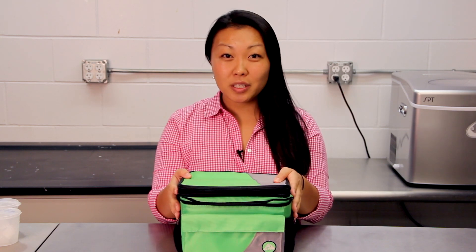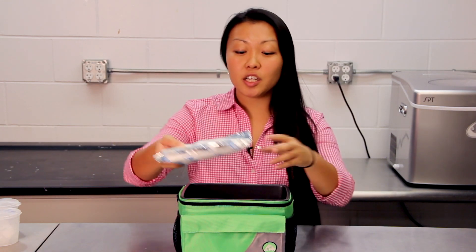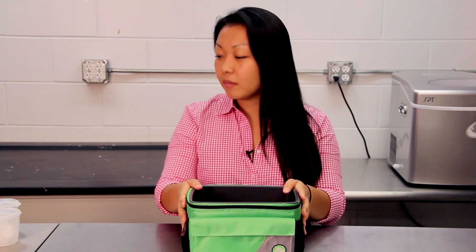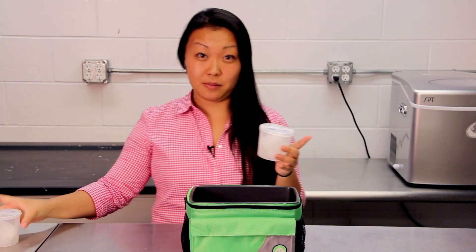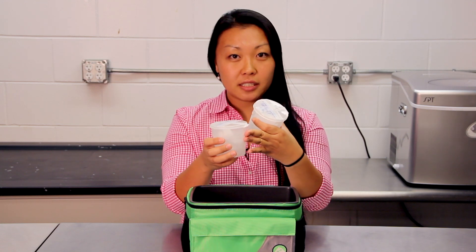Now it's time to ship your ice samples. Take the insulated cooler that we've already sent you along with your already-frozen ice packs. We're going to layer them — the first freezy pack goes at the bottom. Then take your ice specimen cups. You'll notice I have taped these, which helps secure them.